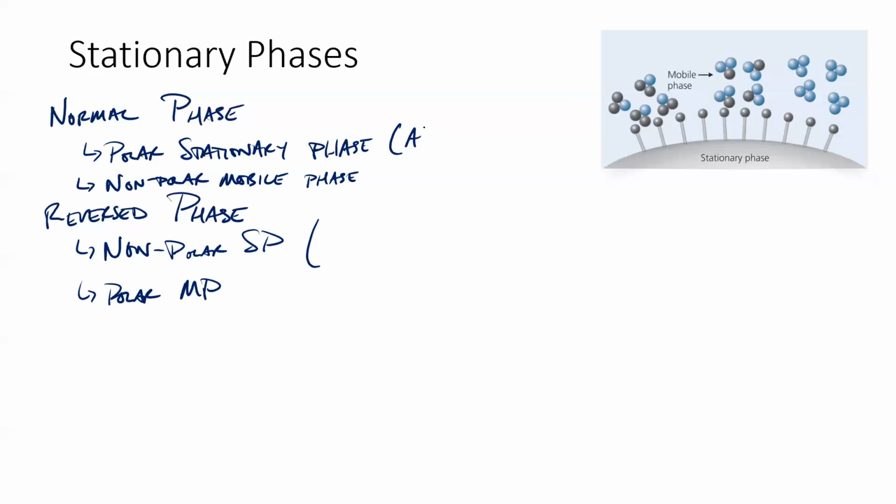Here I'll put that this was Al2O3. This is usually a C8 or a C18 chain. So here they've got sort of this solid chunk of bead, and these really are still mostly made out of alumina or something similar. But what they've done is they've functionalized that surface.